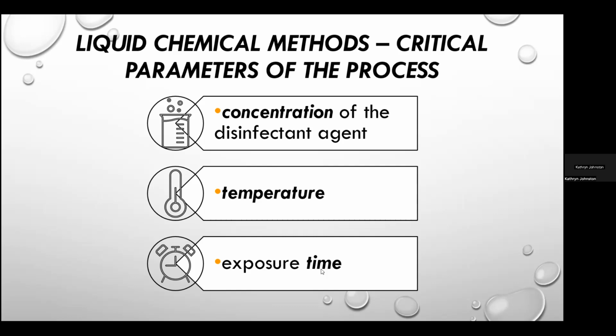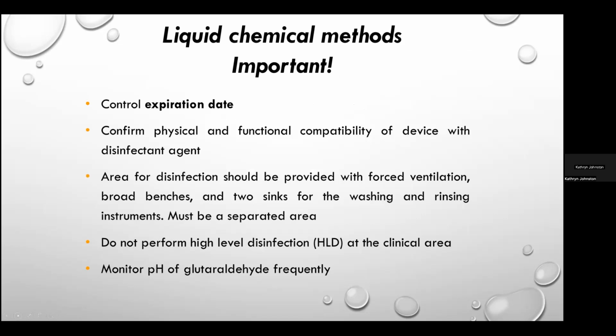For exposure, each disinfection method and agent has a specific amount of time that's necessary, so you have to follow it, because not all products are the same and they may have different exposure times. I talked about the expiry date. You also want to make sure that whatever you're disinfecting is compatible with the disinfecting agent you've chosen.